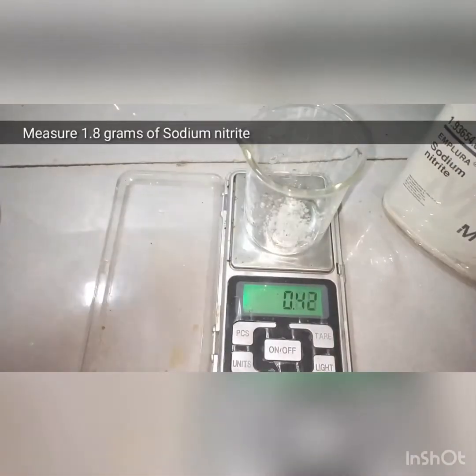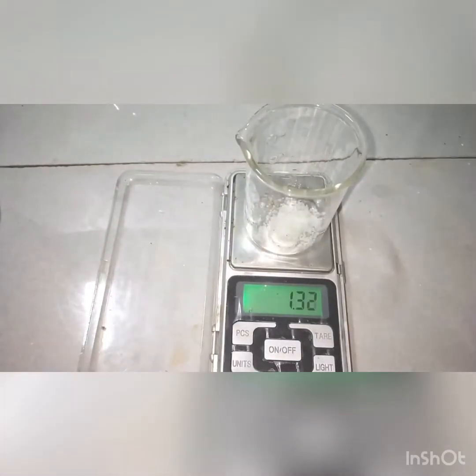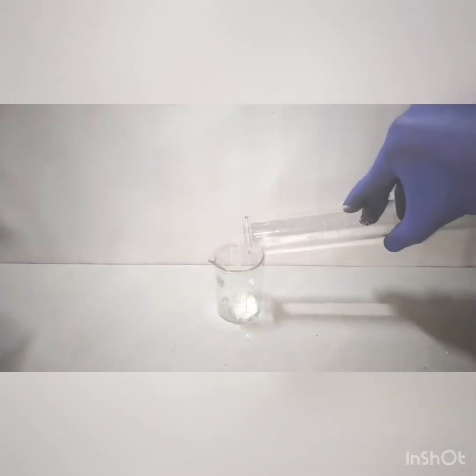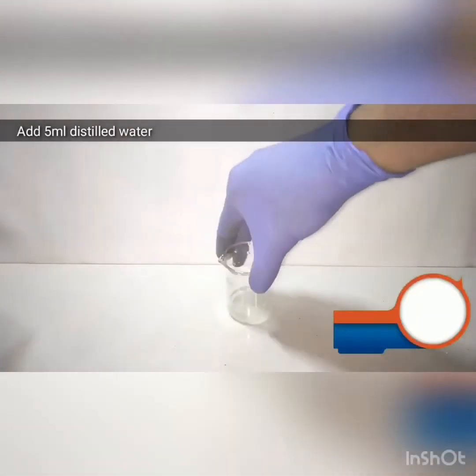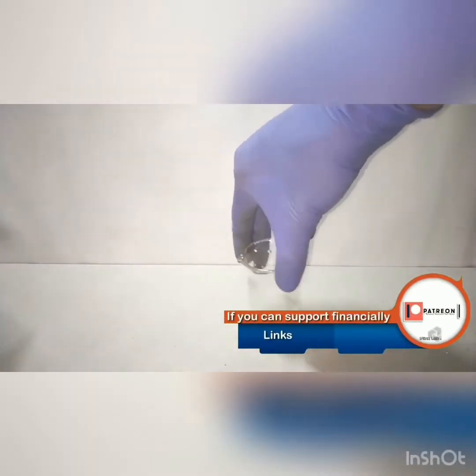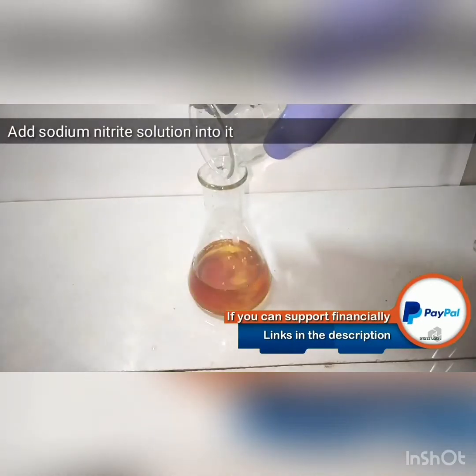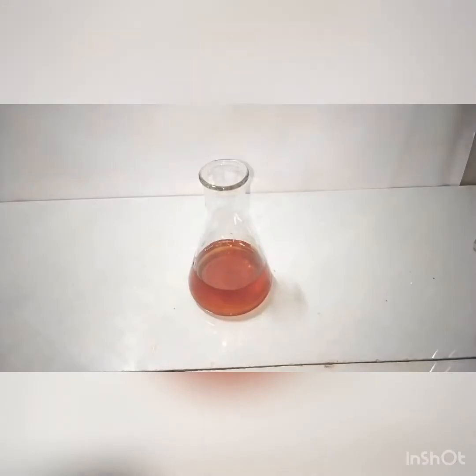Now we measure out 1.8 grams of sodium nitrite — NaNO₂, sodium nitrite and not nitrate. Into that we add 5 ml of distilled water and mix to make a solution. This sodium nitrite solution we then add into the previously boiled and cooled solution of sulfanilic acid and sodium carbonate.